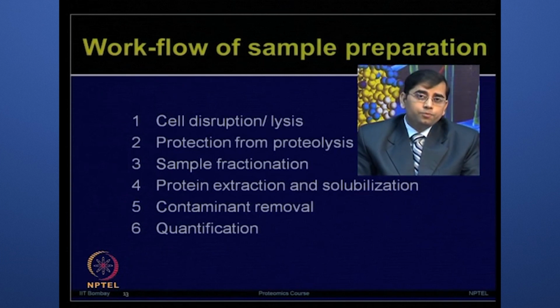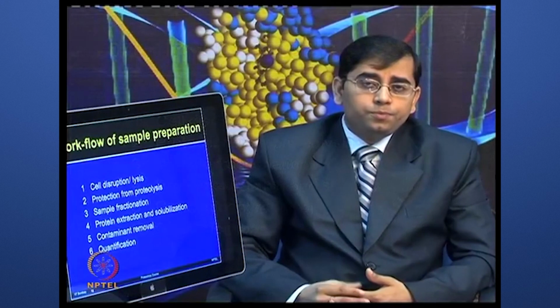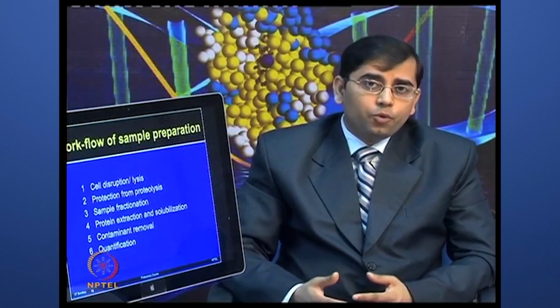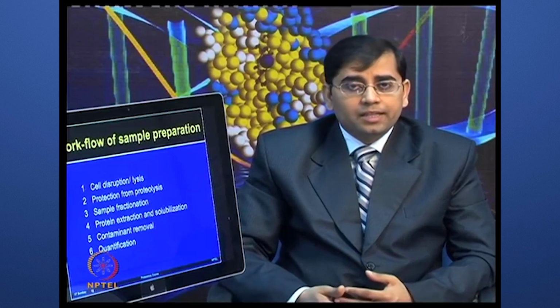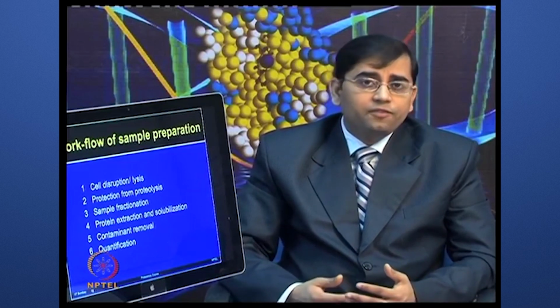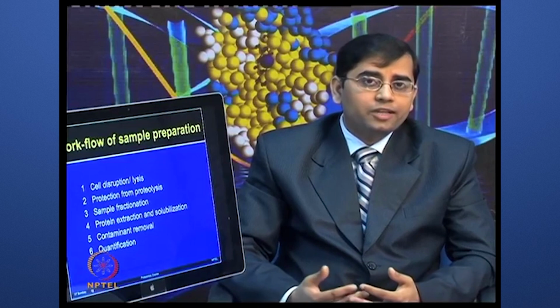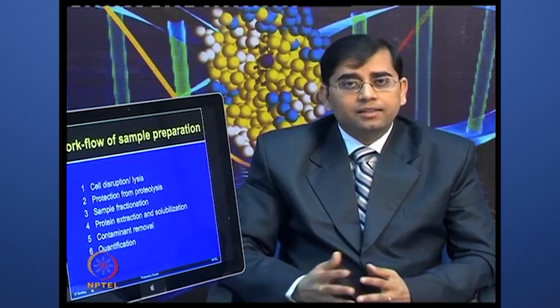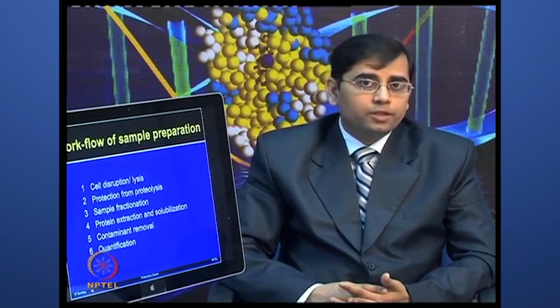Obviously, this workflow can be modified depending upon your sample types, and a few steps can be moved in that sequence. So, let us follow this workflow, and during this workflow I will give you some examples of different types of samples, how to extract protein from those, and what type of challenges these samples are going to impose.